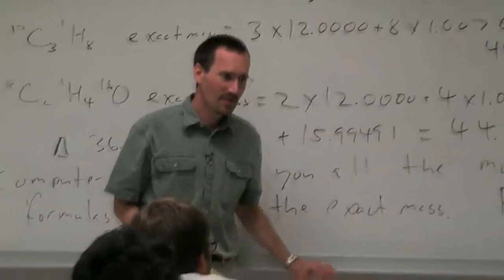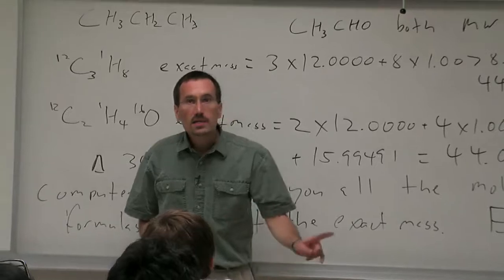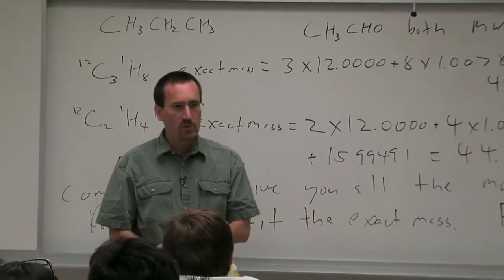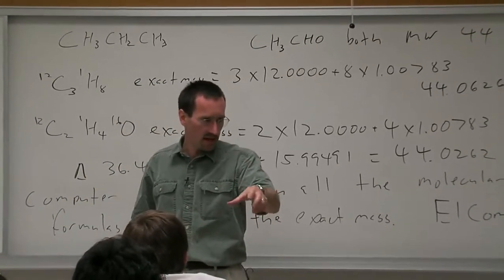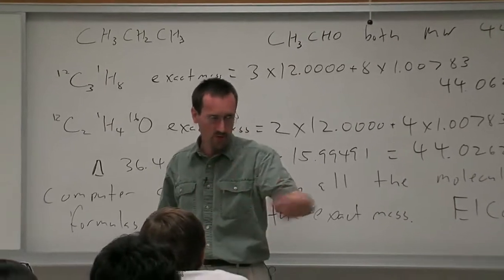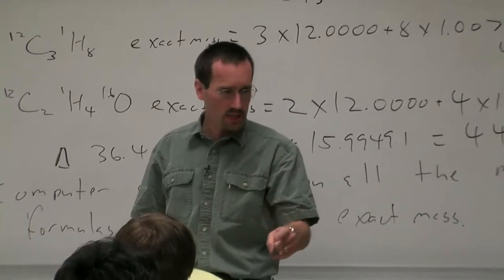Is that another name for an ion trap? That's a similar idea, yeah. So ion cyclotron resonance was a detection method we didn't talk about. An ion trap can basically be used in mass spec, where you first isolate the ions of a particular mass, and then you further collide them or fragment them. But an ICR is a detection technique.